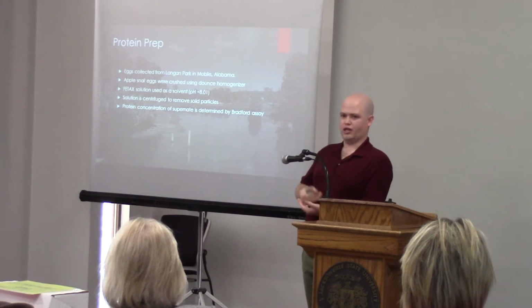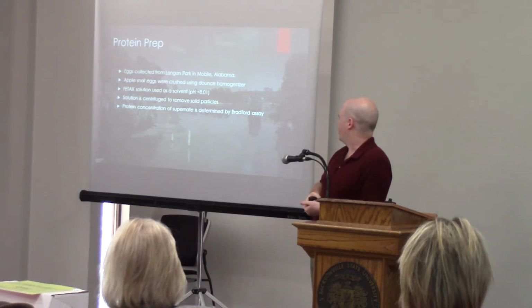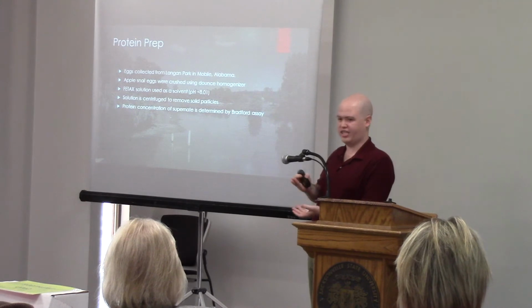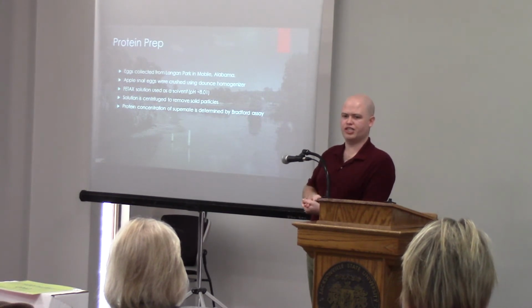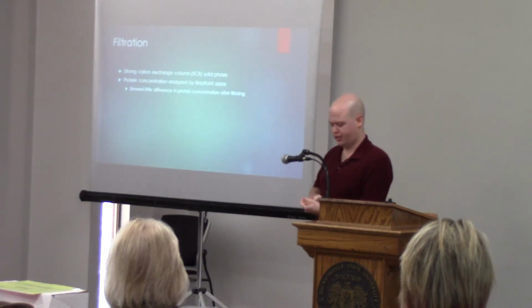First thing we had to do was collect our samples, which Annie was kind enough to do for me. She went down to Mobile, Alabama, and got these giant apple snail eggs and brought them back up here. Crushed them in a Dounce homogenizer, and we dissolved them in FETAX solution, basically distilled water with some salts added back in. We removed solid particles that didn't dissolve well through centrifugation, and then we assessed the protein concentration through a Bradford assay.